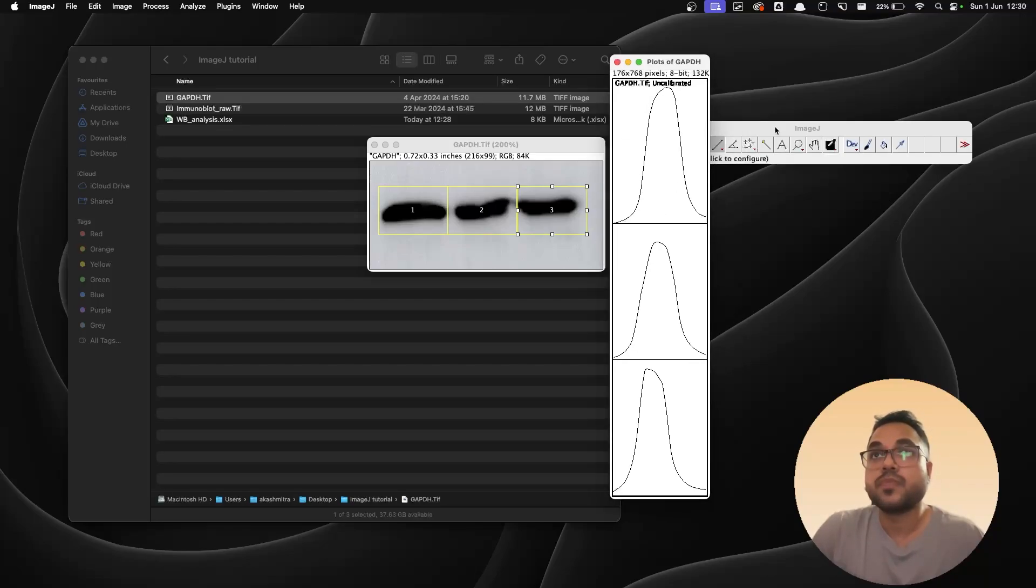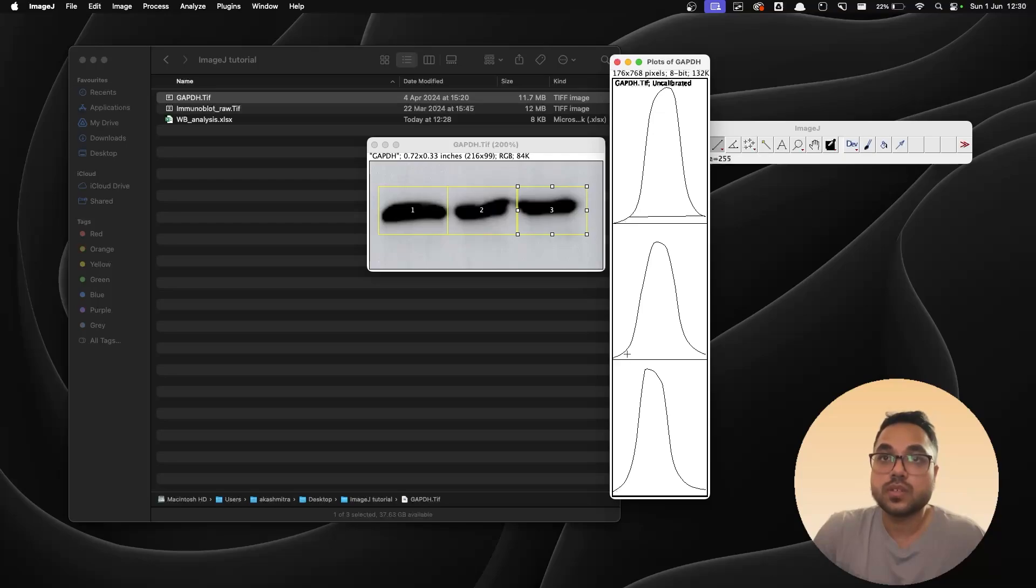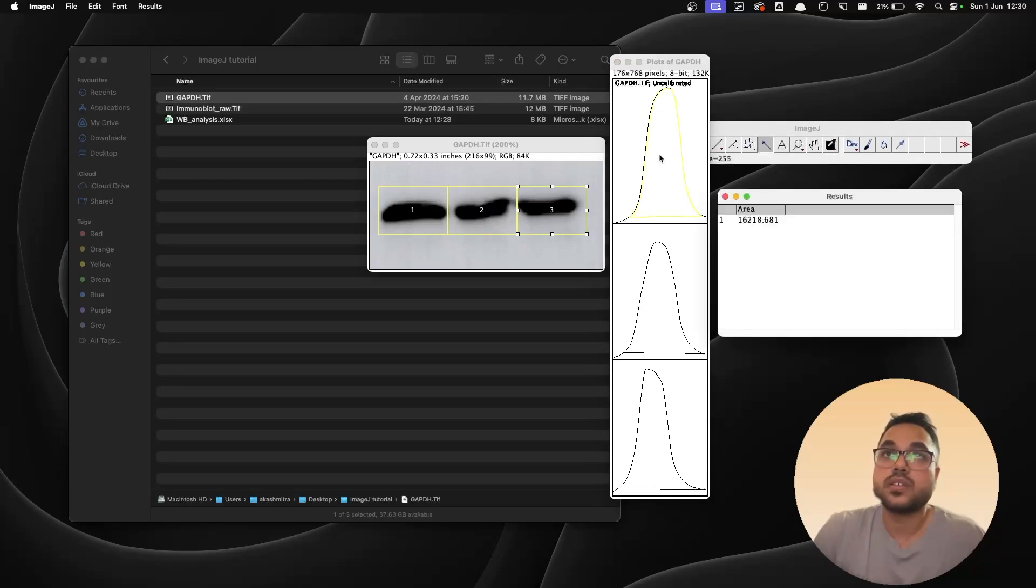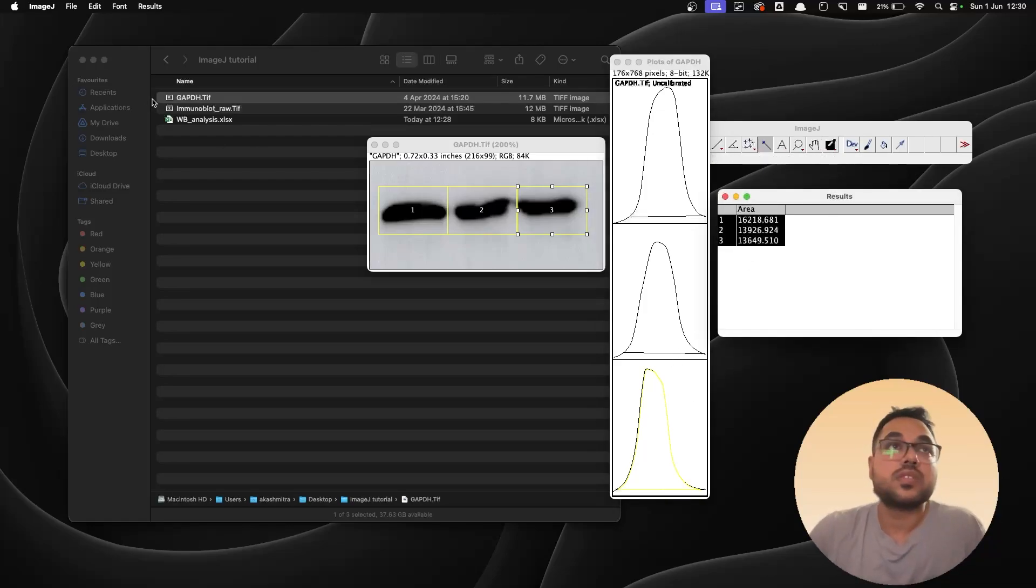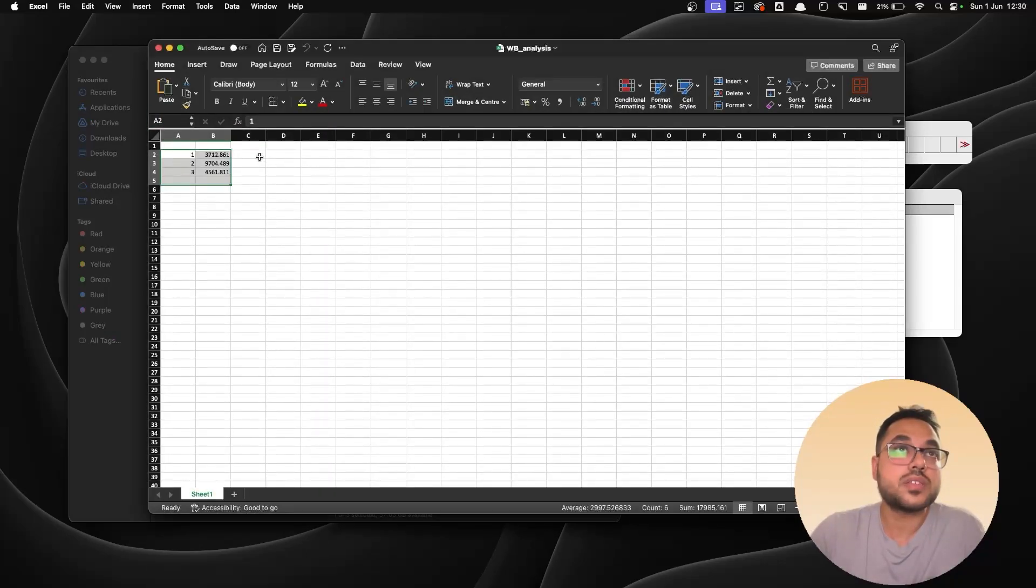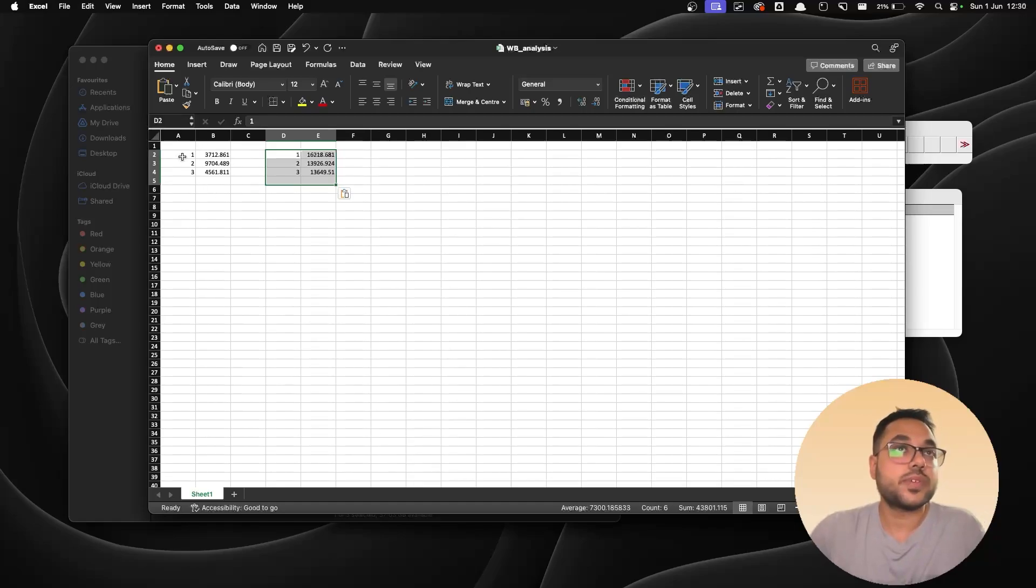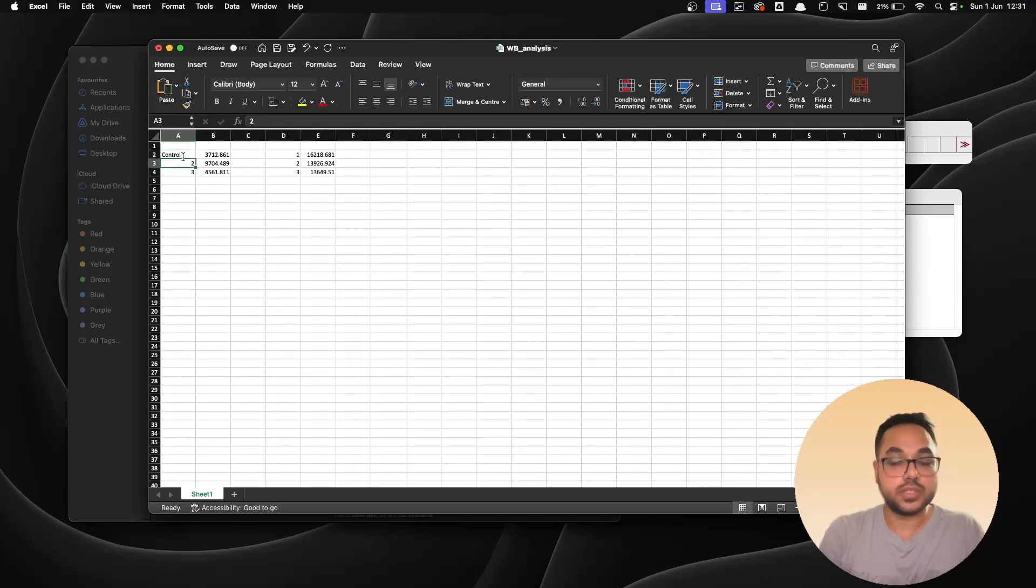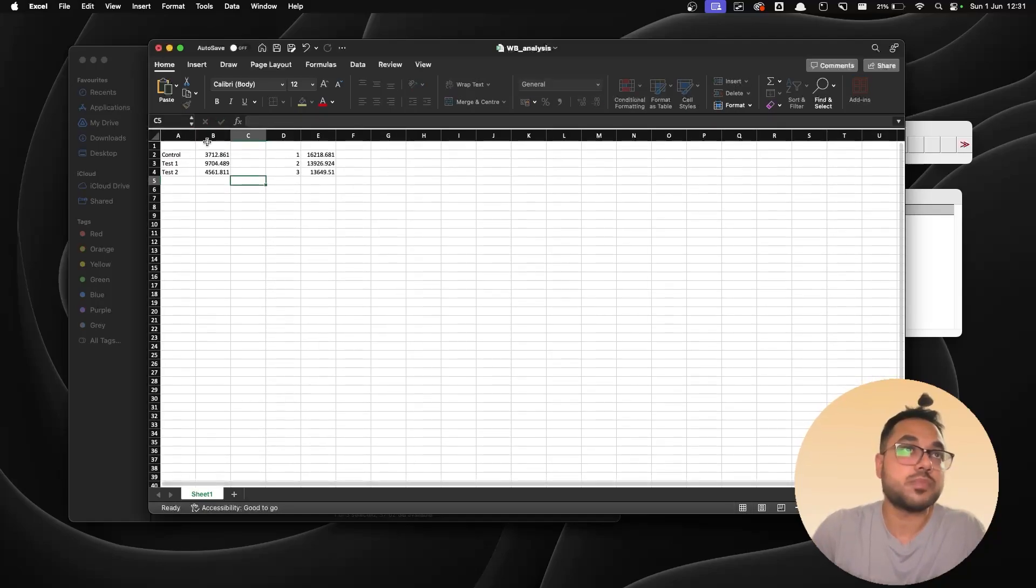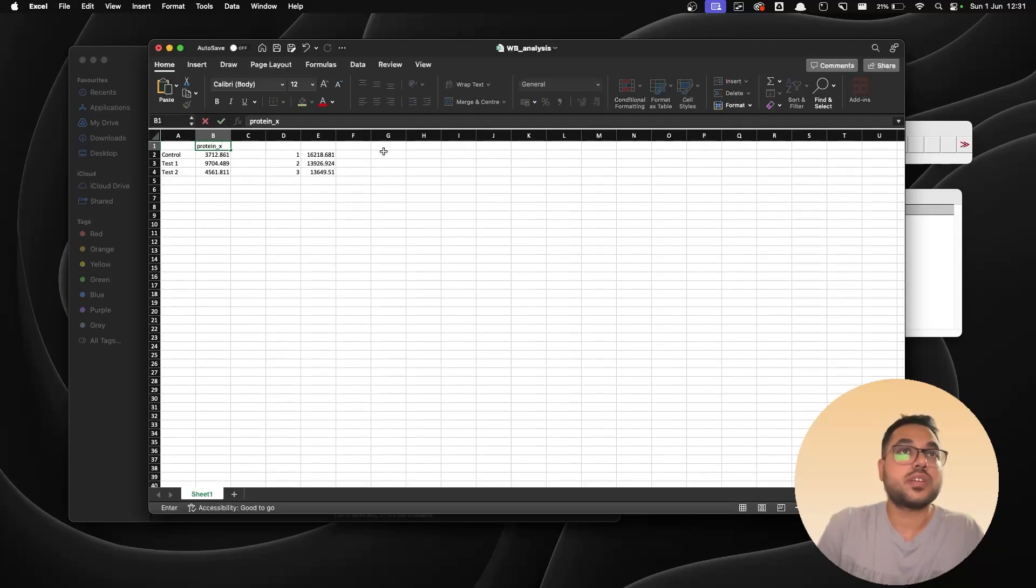Take the line tool, come back to the peaks and you can just join the bottoms to denote the closed area which you want to be analyzed. Get the wand tool, come back and plot them. Copy them, open up your analysis file and you can paste them over here. So quickly I'm going to rename this. This one would be control, this would be test one, this would be test two. And this is going to be my protein X and this is going to be GAPDH.